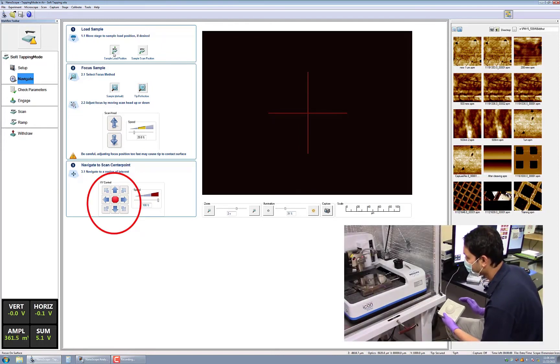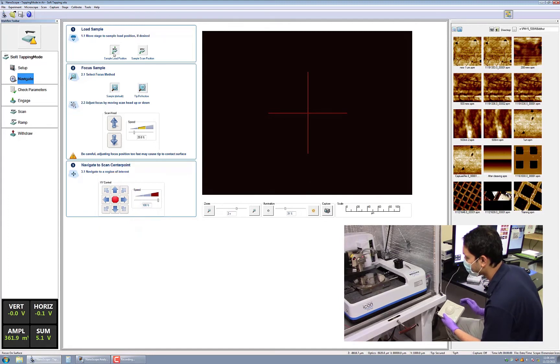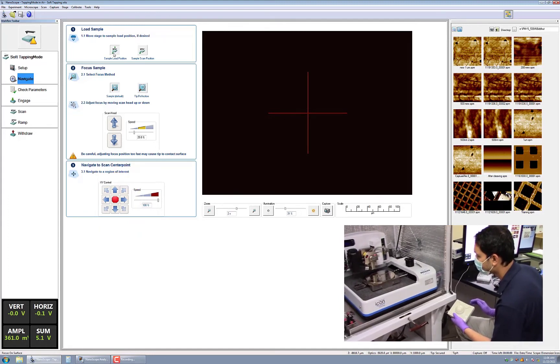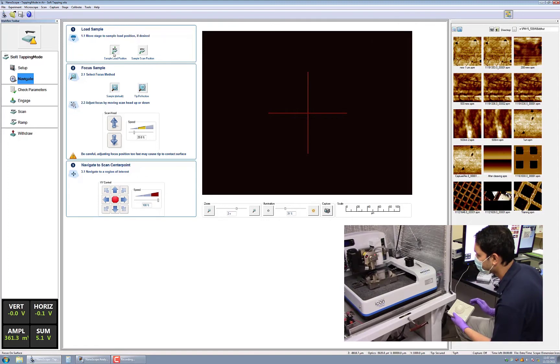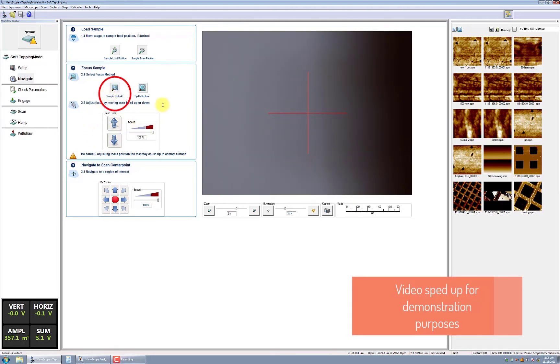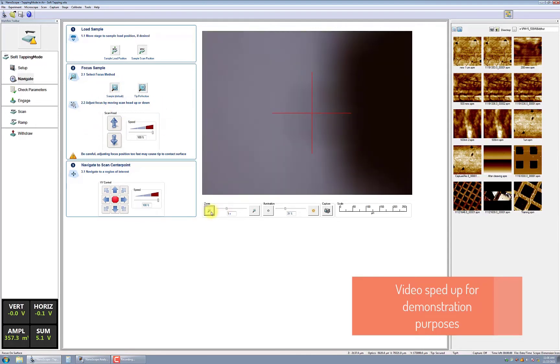Again, it is very important that the scan head is raised to a sufficiently high level to avoid crashing the sample into the scan head. In the next box, you will select the focus method. It is recommended that you select sample, which is the default, if your sample has features to focus on.